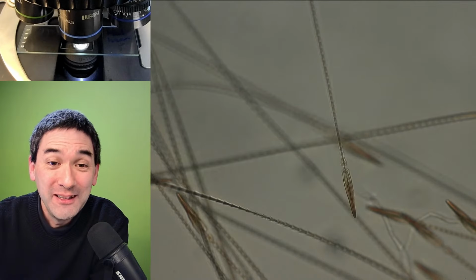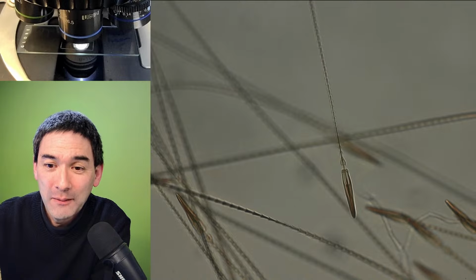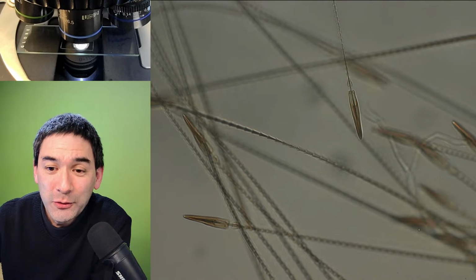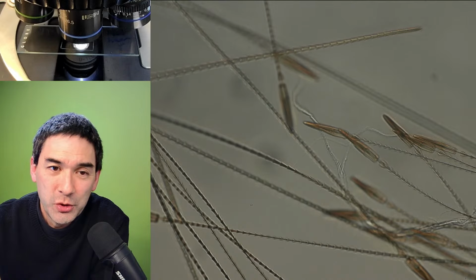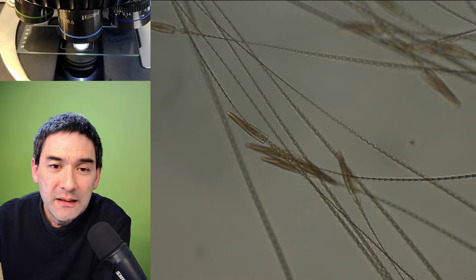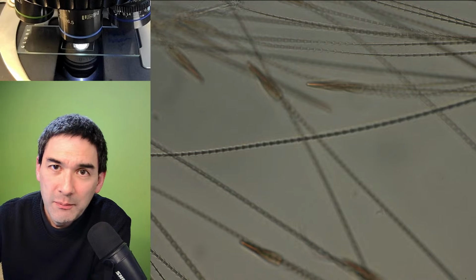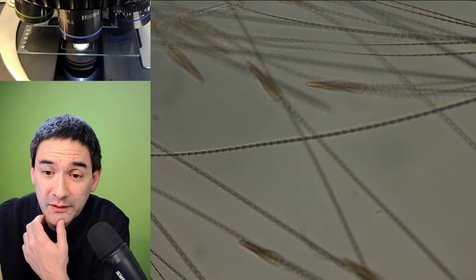That's actually a good one. I mean, they look weird, right? Are they not classed as a form of fiber at all? I don't even know if you should call them fibers. They're officially called setae. Setae are basically the hair of insects.